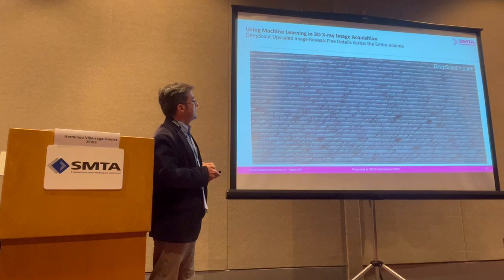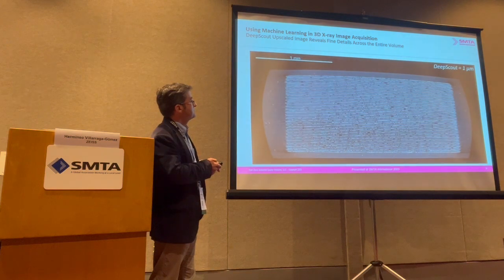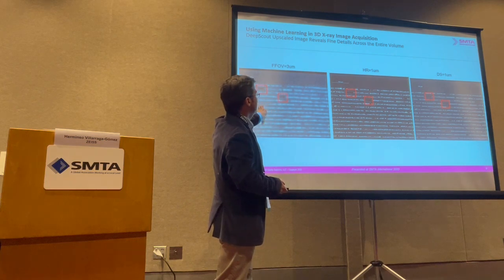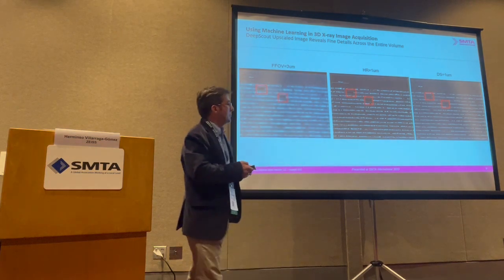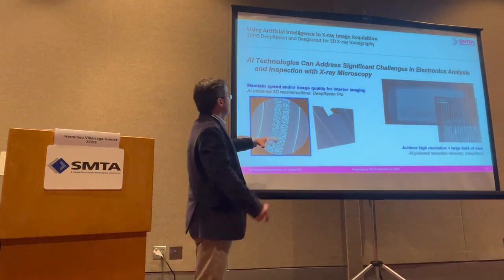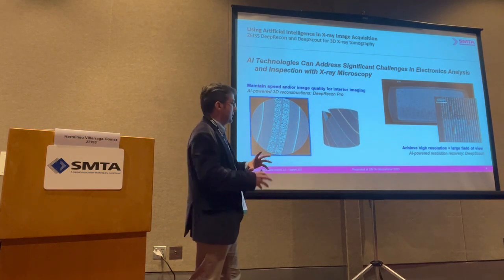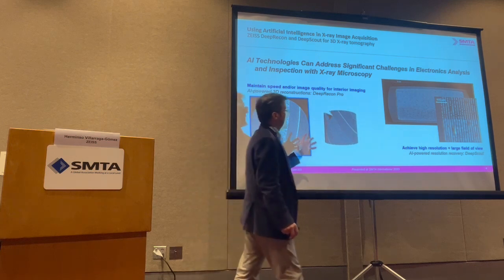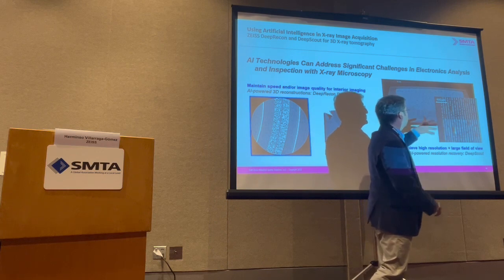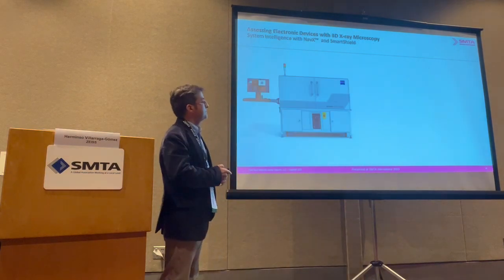And then you can see that across the full field of view, the data has been recovered. And here is a comparison of the normal traditional way of scanning, low resolution, high resolution, and the DeepScout recovery. So as a summary of those deep learning processes, you can use it in two ways. One is to improve the reconstruction in a given field of view, and that's what we are calling deep recon, or DeepScout, which will use a high resolution, small field of view as training to recover the data in a low resolution scan in a larger field of view.